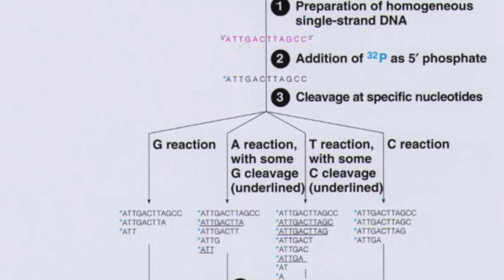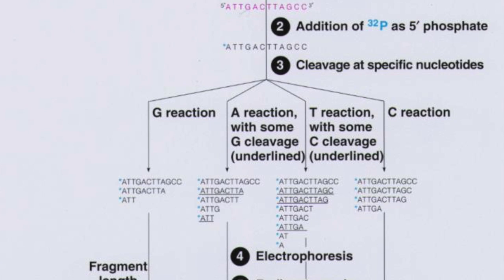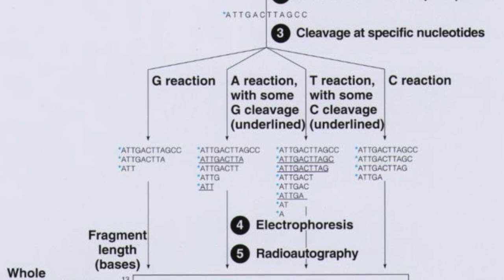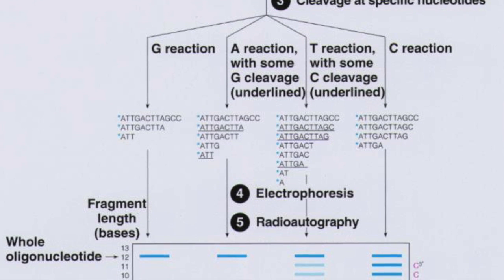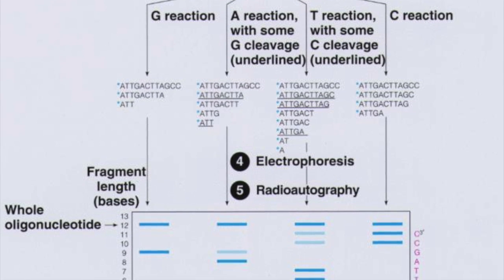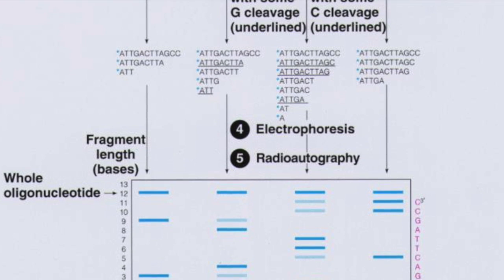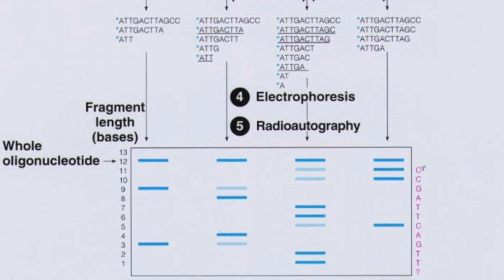Here's where the dimethyl sulfate acts, because it takes the sugar from the base. This is where the methyl is attached to the bases that are marked, and here is where the elimination of the modified base is going to occur. After the modification of the base, is where the piperidine is going to act, and it's going to fragment the DNA chain.